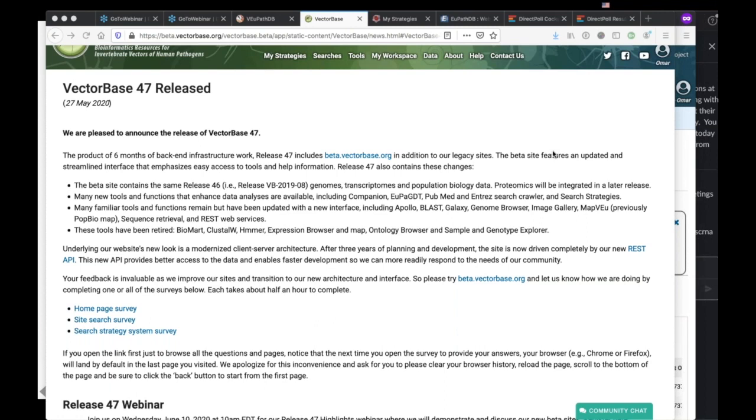So the Virus Bioinformatic Resource Center, which provides access to COVID-19 genomes, may be worth investigating there. In terms of enrichment analysis in general, those can be used anywhere, right? In any case where you have a set of functions or names that you want to determine whether they are enriched in your sample compared to a background, you can use an enrichment analysis, right?